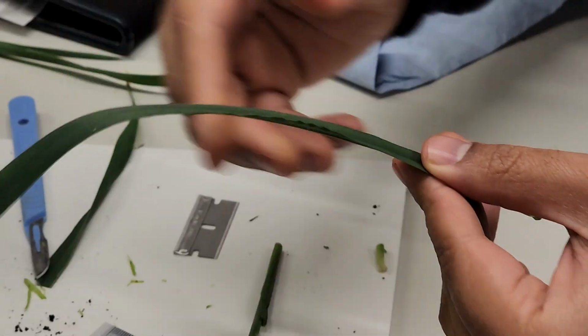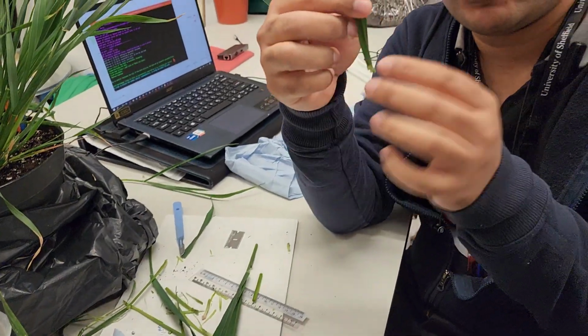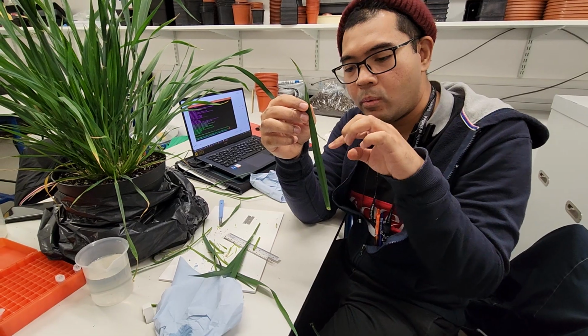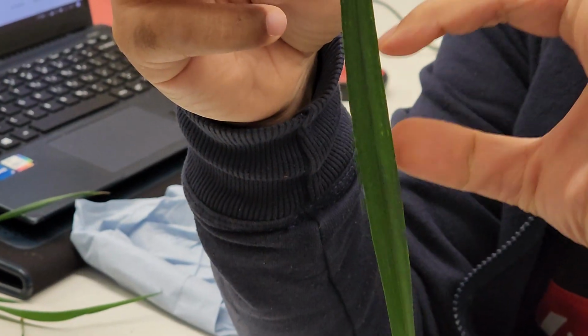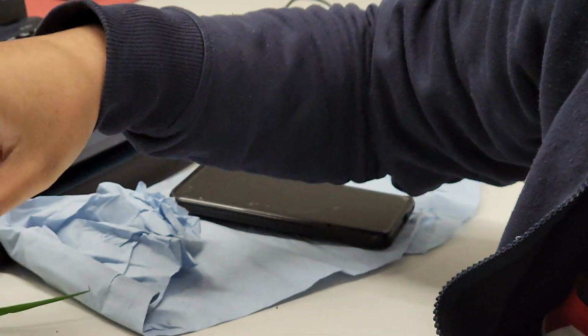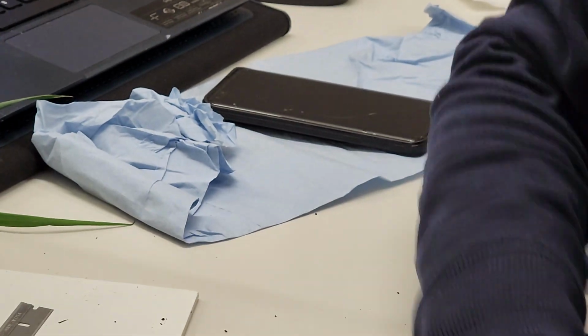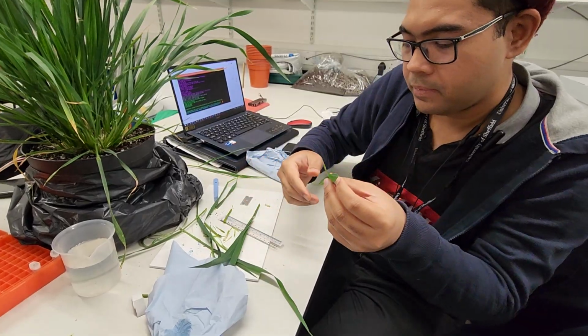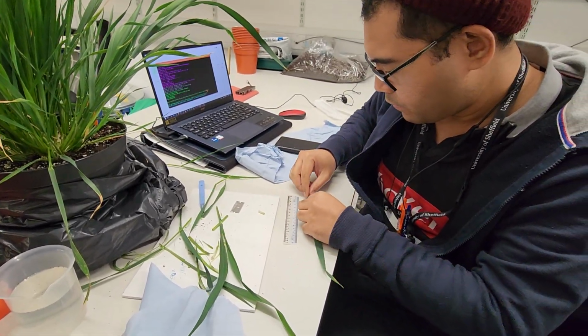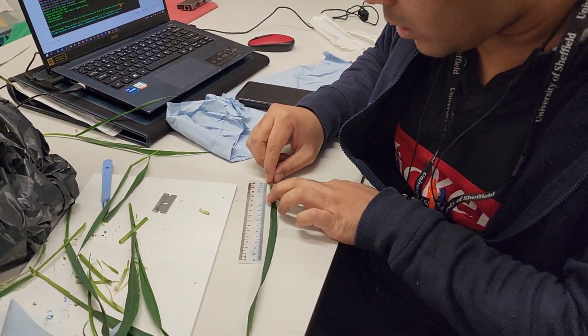So let's take the midsection of this. Usually the midsection, because the morphology of this leaf is lanceolate. That's why we take the midsection, because that's the widest bit of the leaf blade. We measure more or less from the joint or collar.